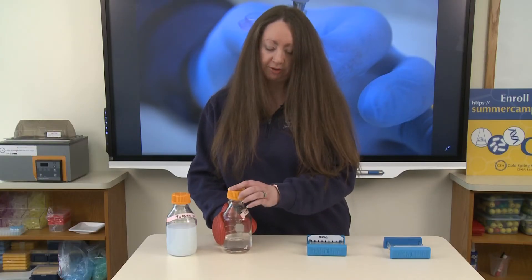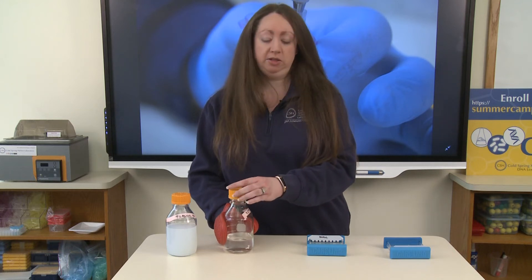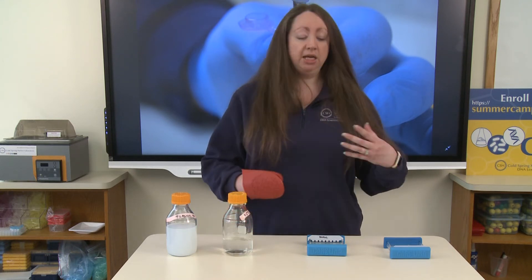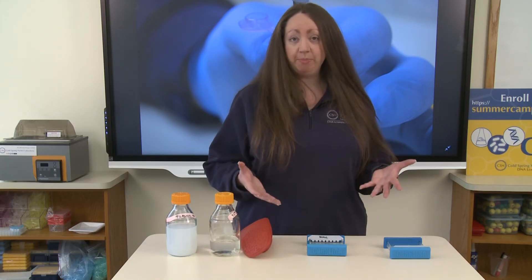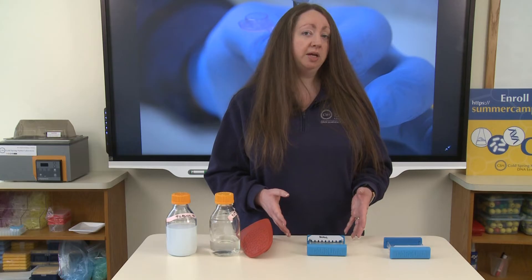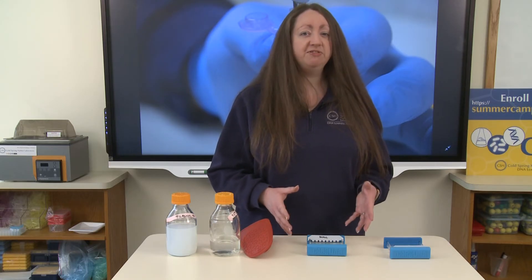Once you pour your agarose gel, do not move it. You want to leave it set until it's fully solidified. As soon as it starts to hit room temperature it's going to start to cool, and this will solidify in about 10 to 15 minutes.